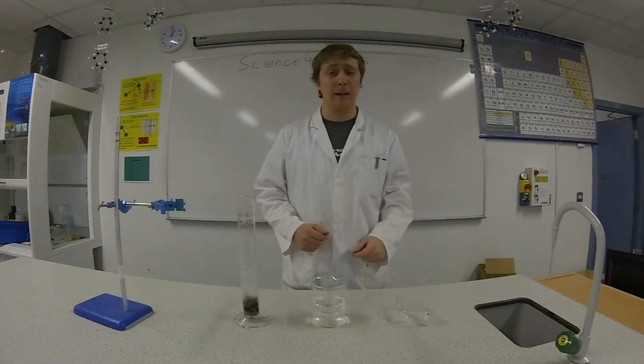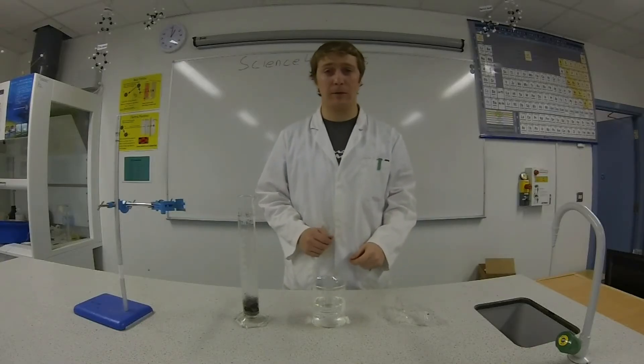Hi, welcome to Science4Schools. In this episode we're going to show that one-fifth of air is oxygen.